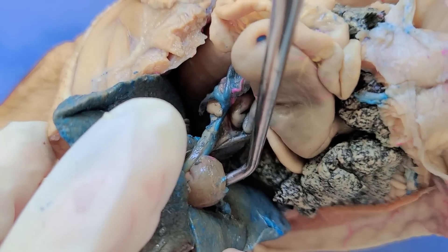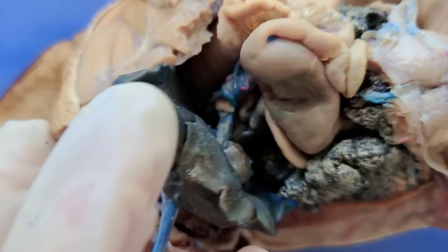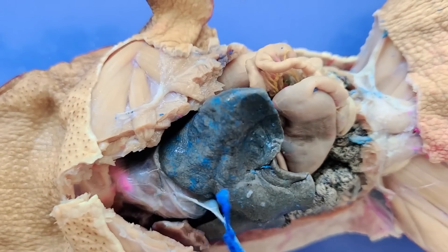Here below the liver is the gallbladder — this pouch-like structure that stores and releases bile that the liver produces.